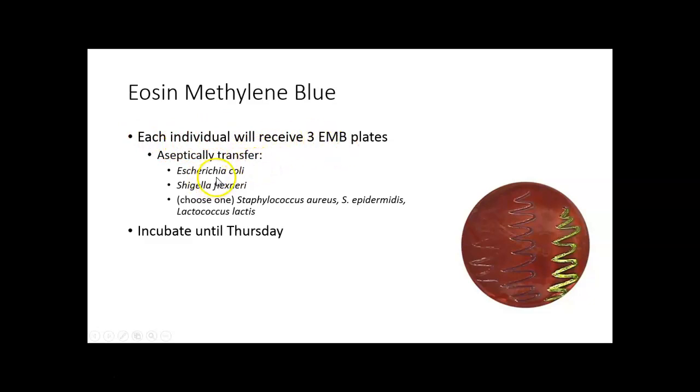And on one of those EMB plates, you're going to aseptically transfer E. coli. On the second, you're going to aseptically transfer Shigella. And on the third, you're going to aseptically transfer either Staphylococcus aureus, Staphylococcus epidermidis, or Lactococcus lactis. So one of the 3, depending on what you have at your table. You'll incubate until Thursday, inverted.